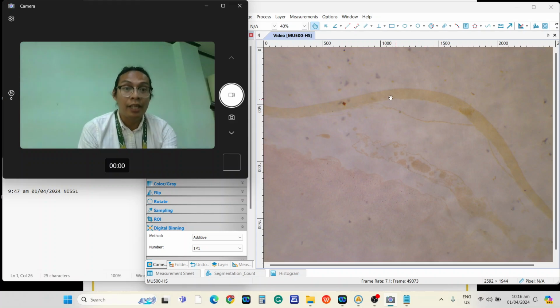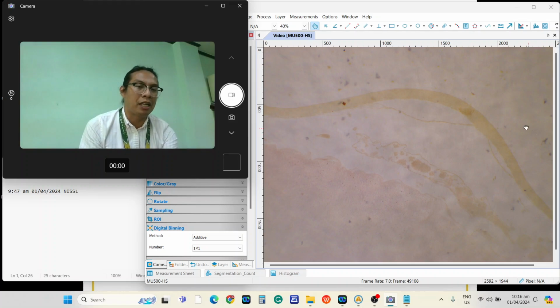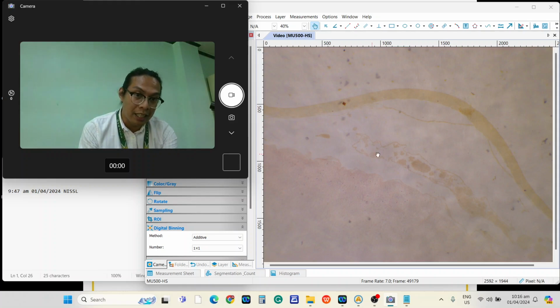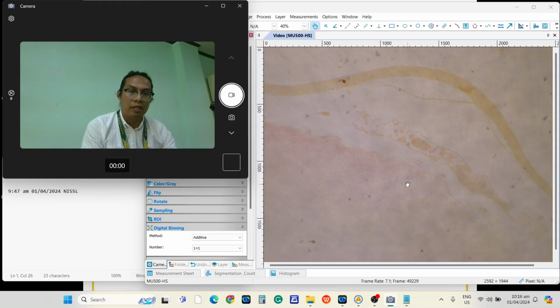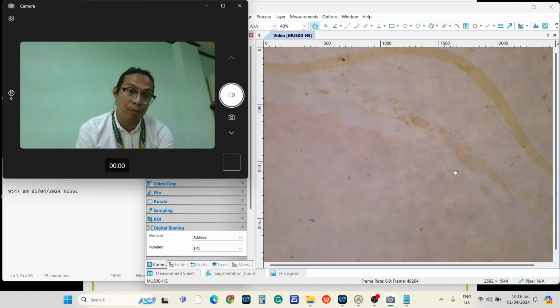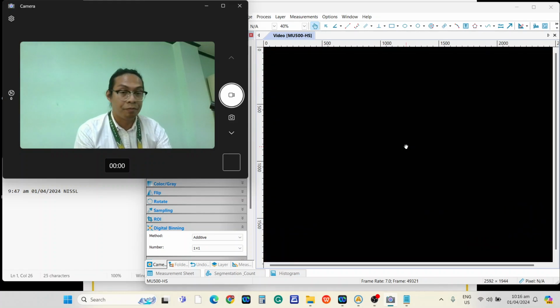Subdural space. Yung nasa ibaba, of course, is the epidural space. Pero hindi natin ma-appreciate yan kung walang buto. Kasi usually nakikita yan sa buto. Again, epidural space, the dura mater, the subdural space, and that is the arachnoid. And finally, yung connective tissue na nakadikit mismo sa nervous tissue. This is already the nervous tissue. That is the spinal cord. That is the pia mater. Napapansin niyo yun? That is a delamination of the pia mater.